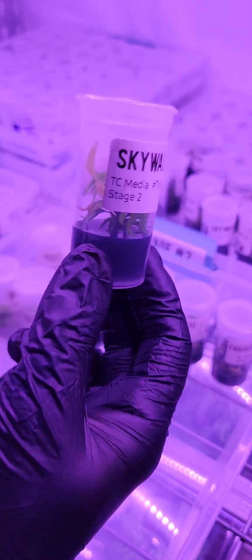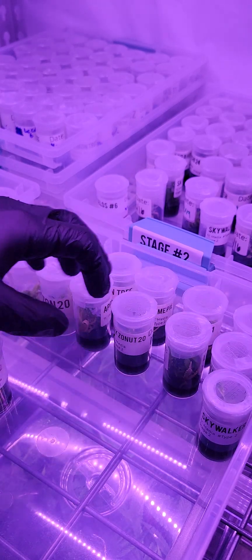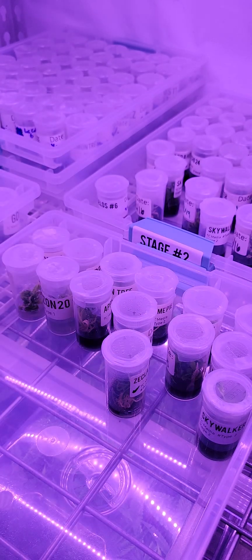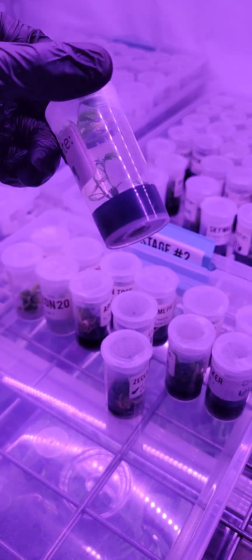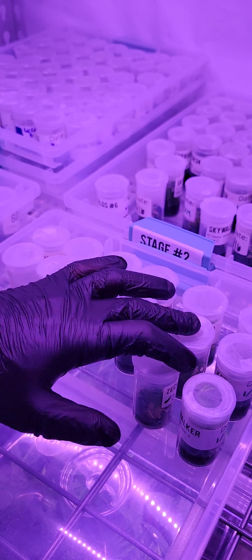Grown in a pop top — it doesn't have to be fancy. Some people will tell you it does, but they also want to charge a ton of money and make it seem like rocket science. This stuff was invented in the 1930s and theorized in the 1800s — they thought you could probably grow plants in test tubes back then, while riding horses. Turns out you can. Today, with everything available on Amazon and the sum of mankind's knowledge on the internet, you too can grow plants in a pop top or any vessel you can autoclave and sterilize.